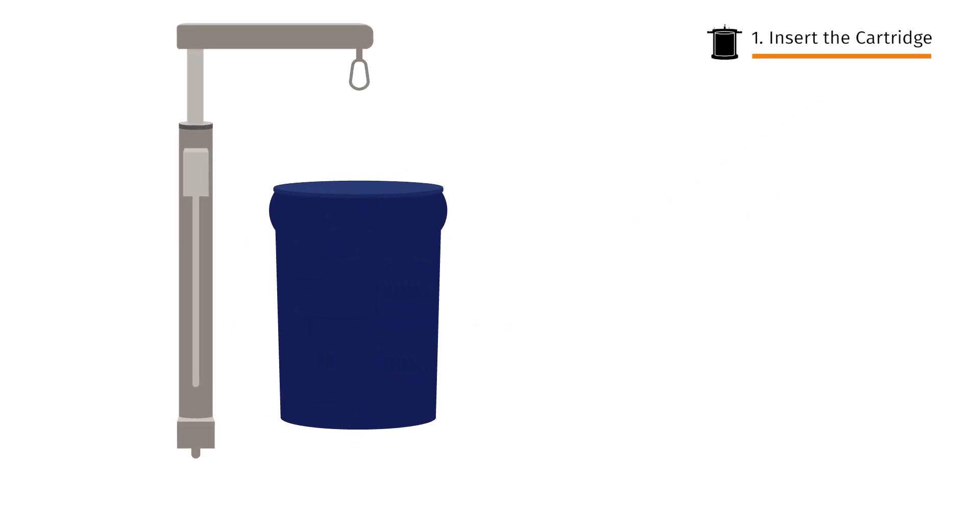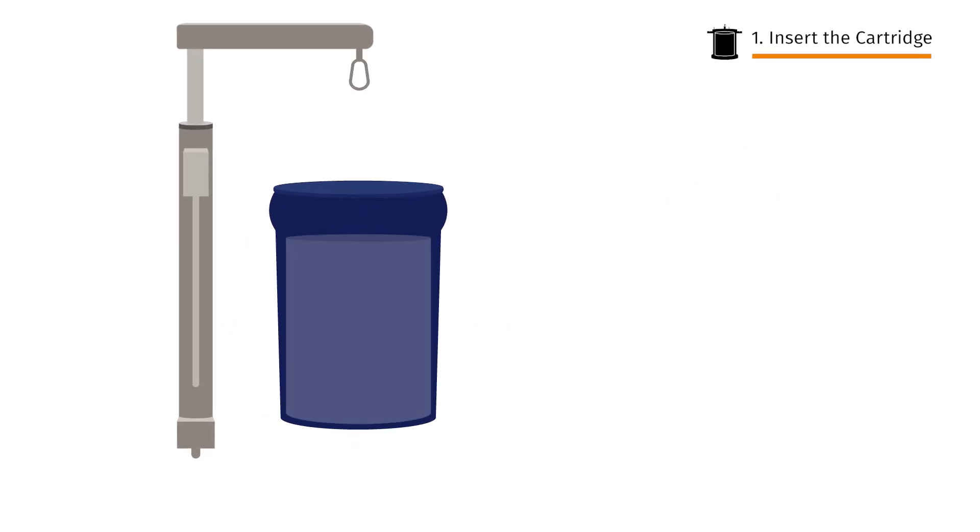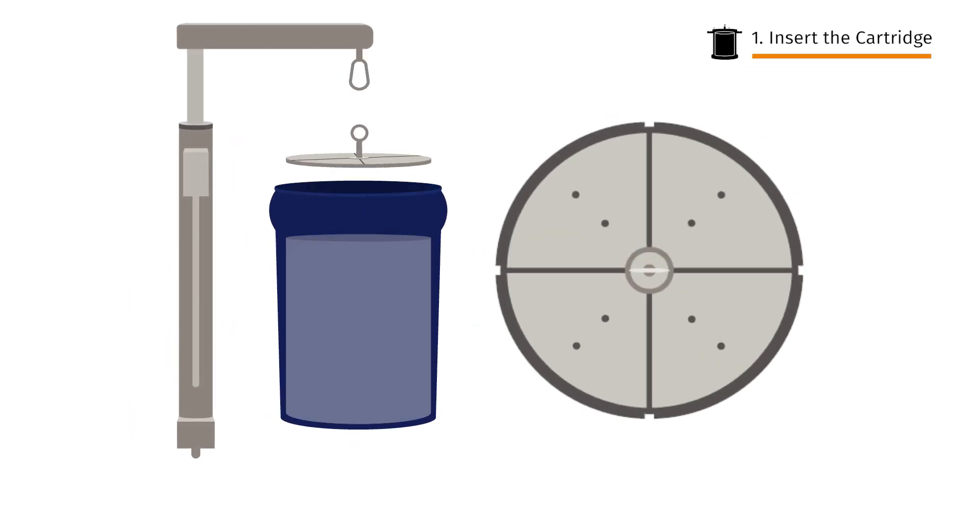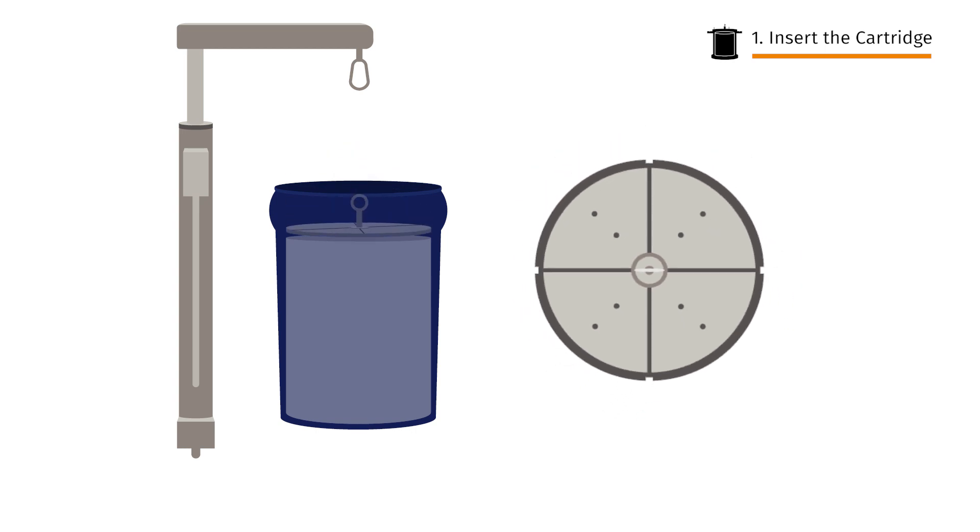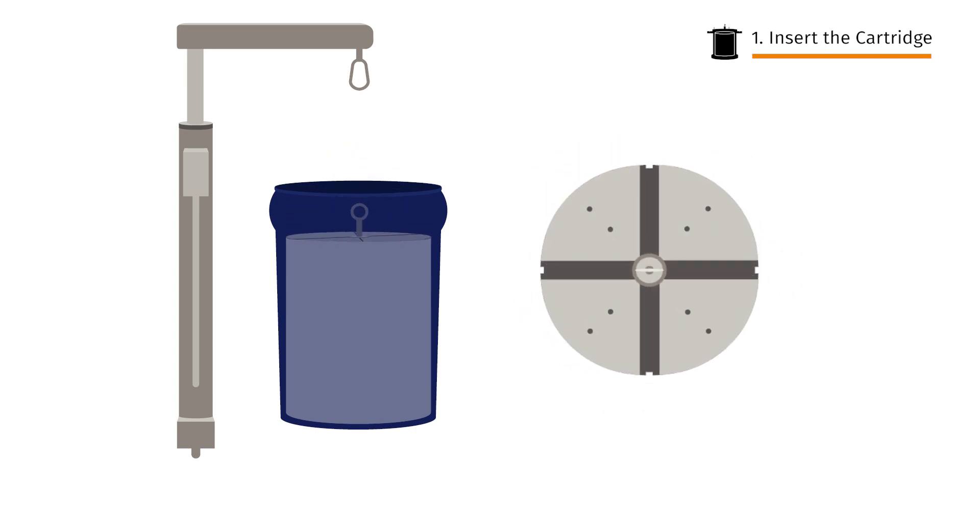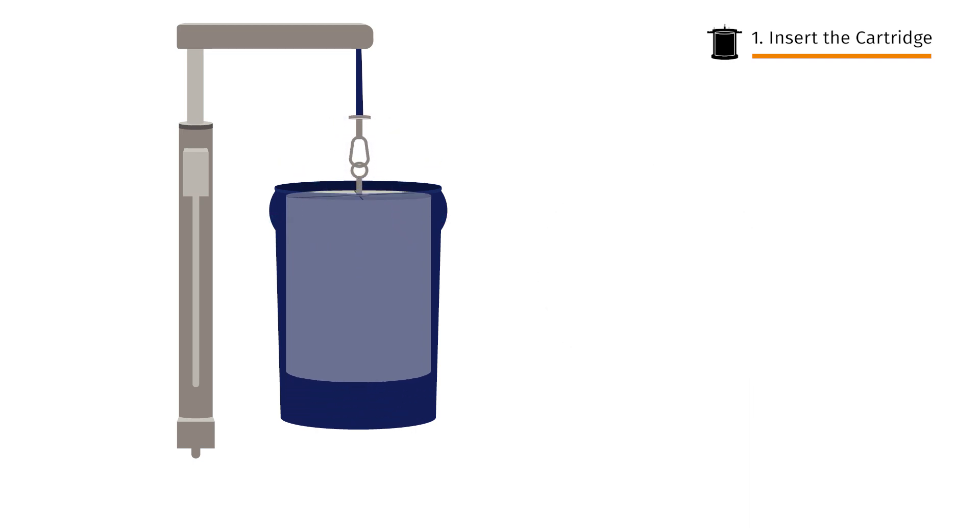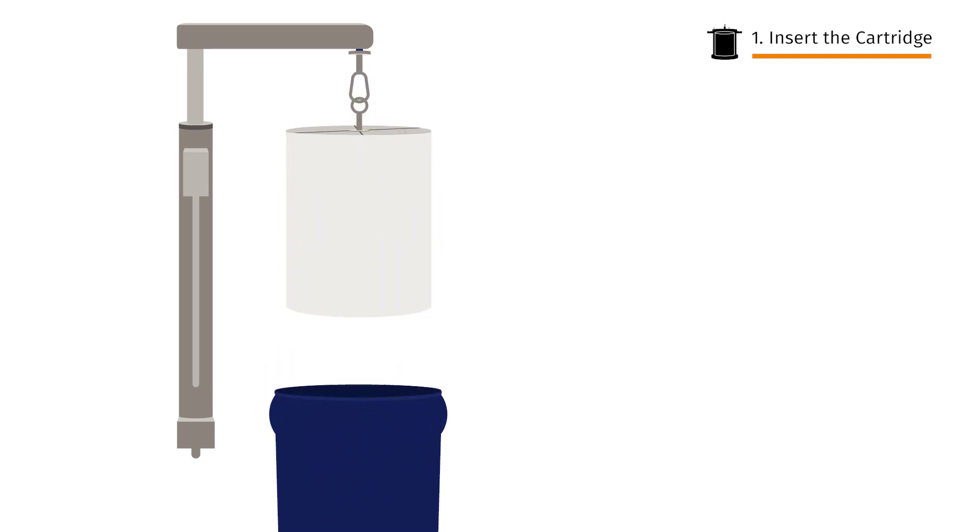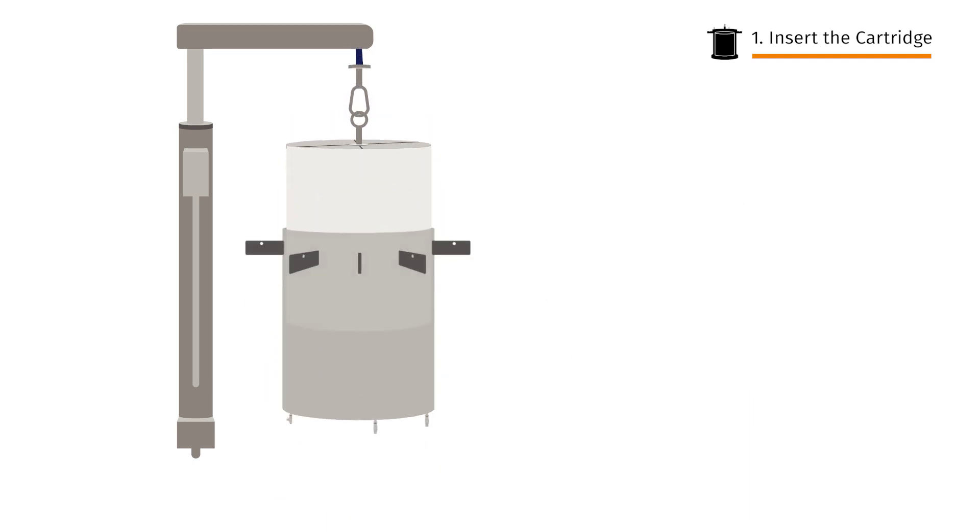First the cartridge is lifted in place. Put the lifting tool on top of the cartridge and slide the lock leaves into position. Attach the hoist cable and lift the cartridge into the compression module.